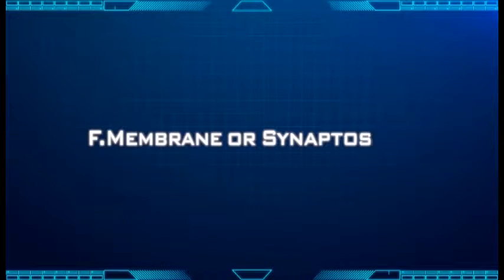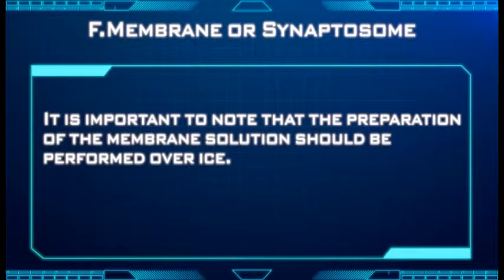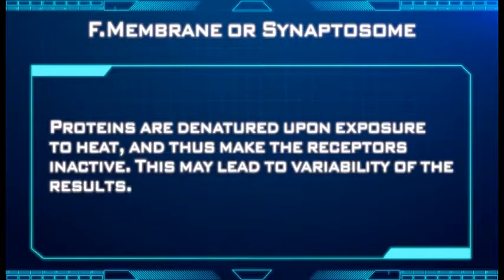F. Membrane or synaptosome. It is important to note that the preparation of the membrane solution should be performed over ice. This is to prevent denaturation of protein. Proteins are denatured upon exposure to heat and thus make the receptors inactive. This may lead to variability of the results.